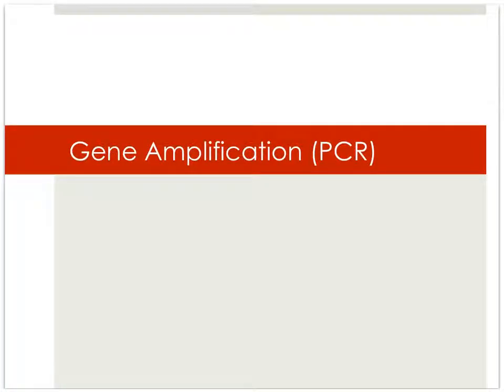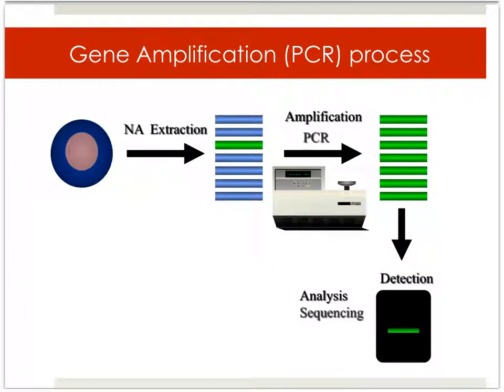PCR, again, many of you are familiar with PCR, but my focus will be mainly on the principles of how you amplify a gene, what kind of considerations you make for a gene. As much as possible, we'll do that, and maybe we'll take a break.